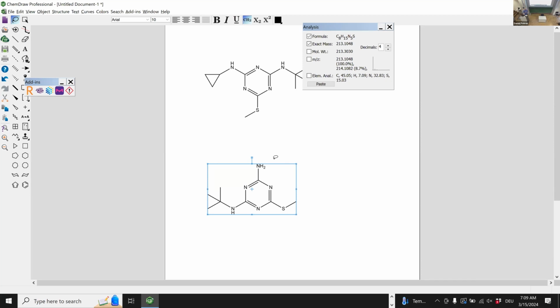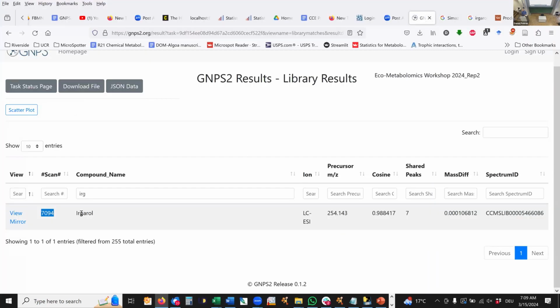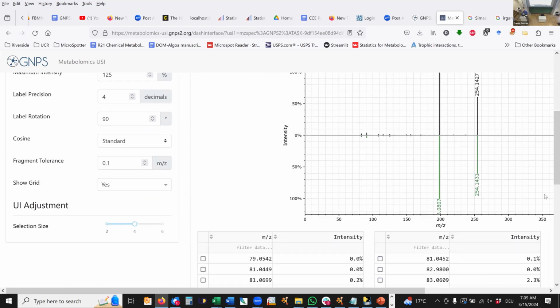Yes, I would definitely take a look at the mass spectra, right? We could now open them in MZmine, or I personally use the GNPS dashboard because it's directly online. So I could go online and just look for this mass in the original files and visualize the mass spectra. And then I could compare them already, right, between the two. And then I could also look at the mirror match. This I actually can do directly here in GNPS2, right? There's this mirror match button. So I inspect already the MS/MS match, right? And I was like, oh, that is beautiful.